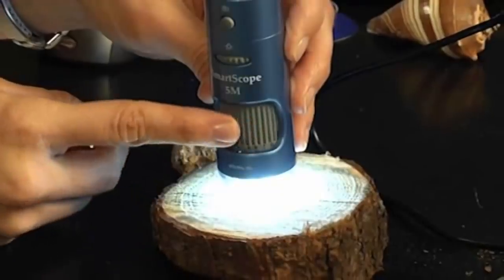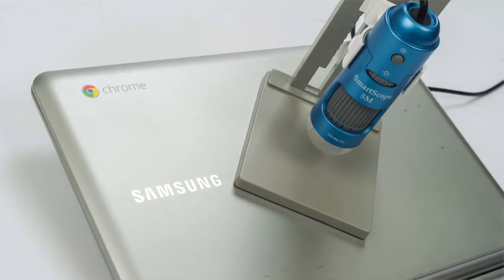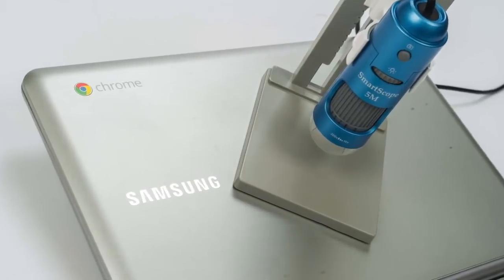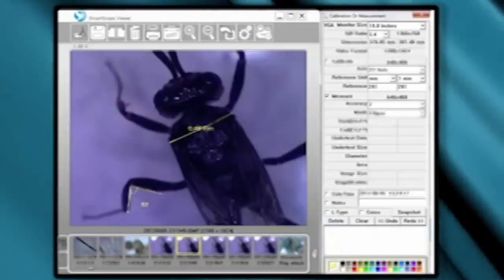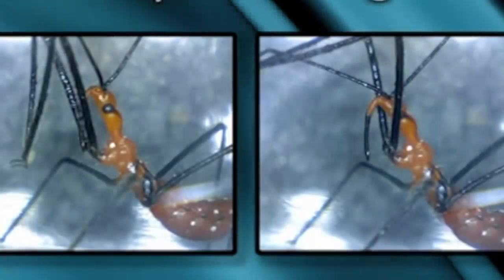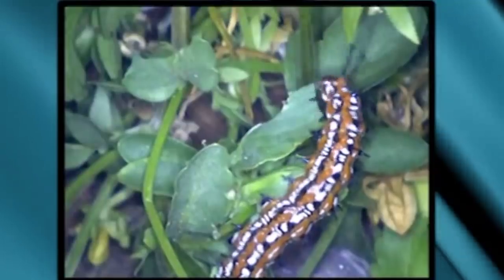The Smart Microscope 5M by Smart School Systems is a visual learning tool that gets students excited and keeps them engaged. It includes the Smart Microscope Online Viewer web app, so no software install is needed, making it perfect for Chromebooks — the most popular computing device in U.S. classrooms. This is an educational tool unlike any other, with advanced features like measurements, side-by-side comparisons, assessments, annotations, and the ability to save directly to Google Drive.